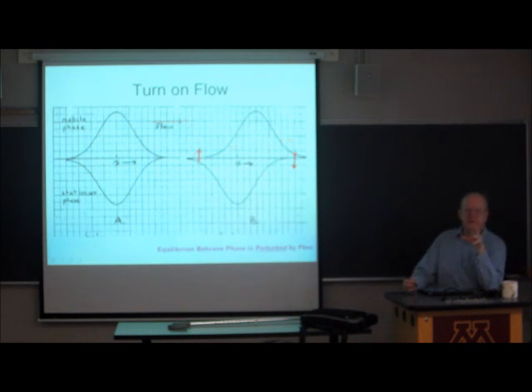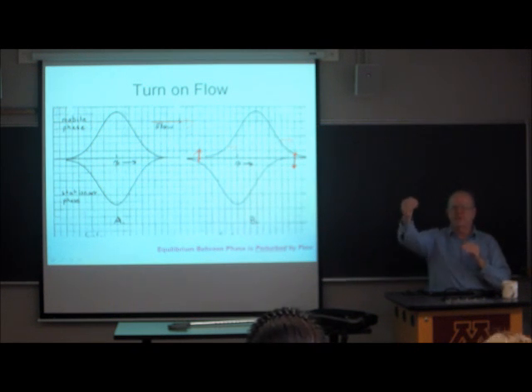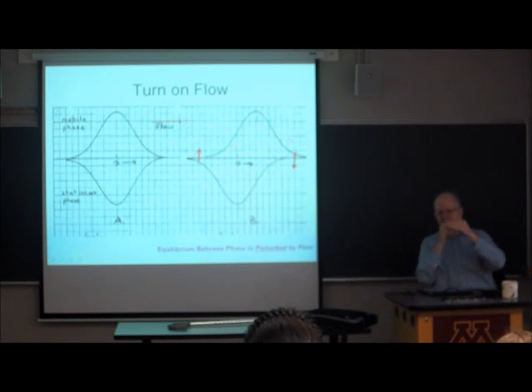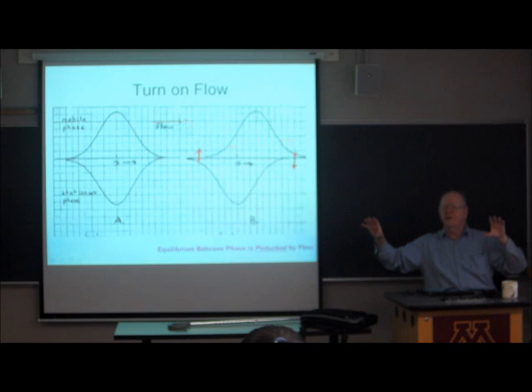The slower this process of transfer from the mobile to the stationary and from the stationary to the mobile, the wider the peak is going to be when it finally comes to equilibrium again.